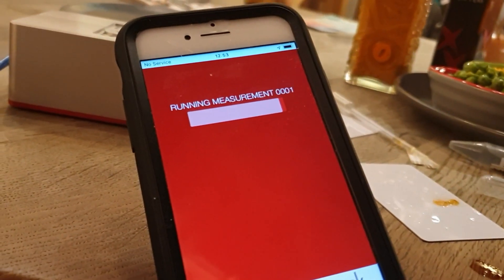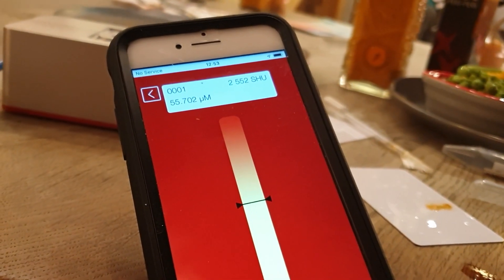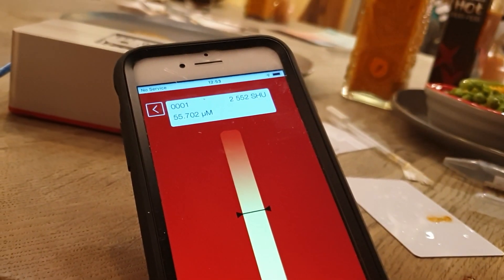This has come to the end now, and the result is 2,552 Scoville heat units. Perfect, thanks very much.